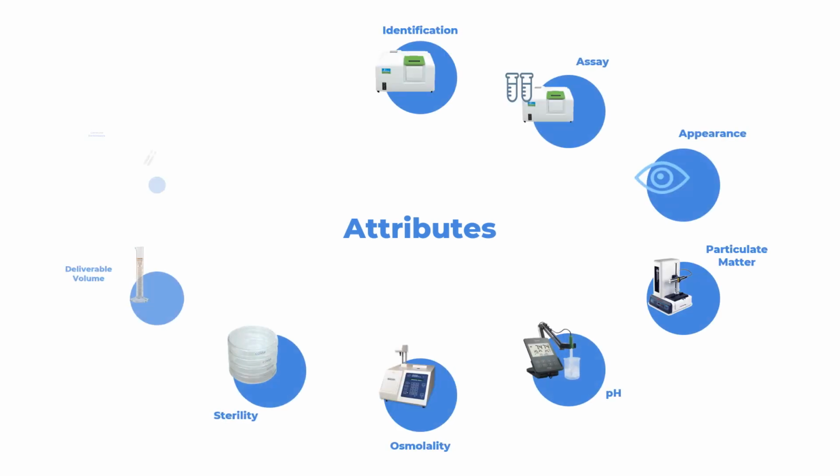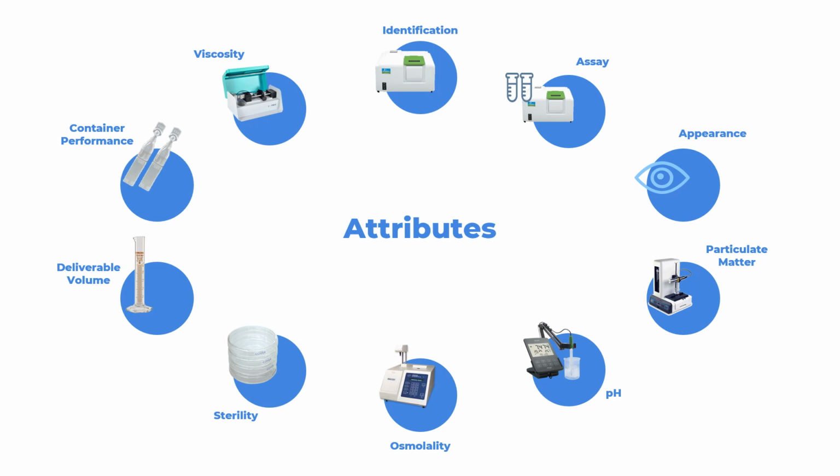Evaluation is essential for an eye drop to ensure its quality, safety, and efficacy. We will look at 10 attributes that are necessary to be controlled and evaluated for eye drop product.